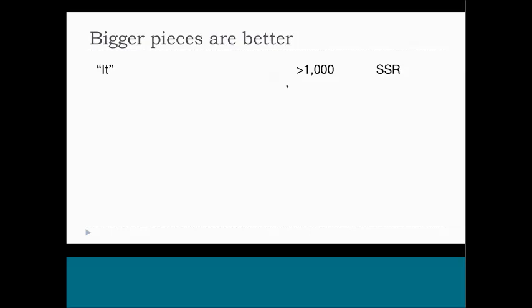And so these kind of reads are analogous to simple sequence repeats. They occur in this particular book I'm talking about over 1,000 times, and so you can't confidently reconstruct. As the sequencing reads get longer and your shreds of paper get longer, it becomes a little easier to place where fragments are coming from. So in this book, it appears 320 times, so maybe like a transposable element. "It was the best" occurs twice in this book, so maybe like a segmental duplication.